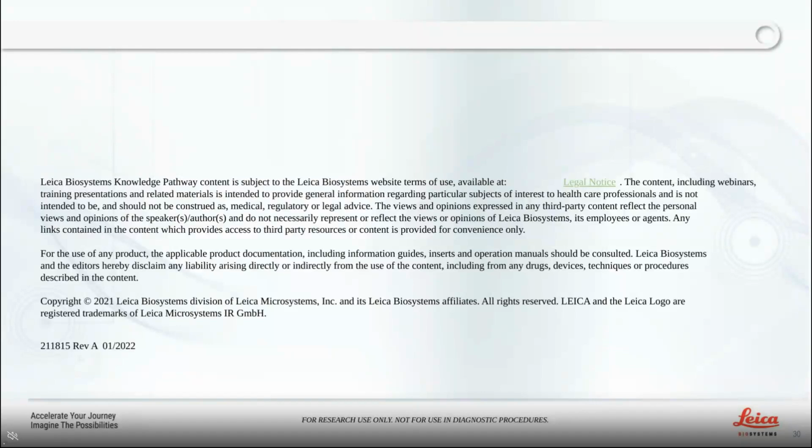I will say that the best way to collect tissue from the cryostat will be to collect them directly onto the slide. Try avoiding using a brush as we usually use for microtomy. This tissue is not embedded in paraffin, and it can be harmed by the use of a brush. So try to just collect this straight onto a charged slide that will help with the tissue adhesion.